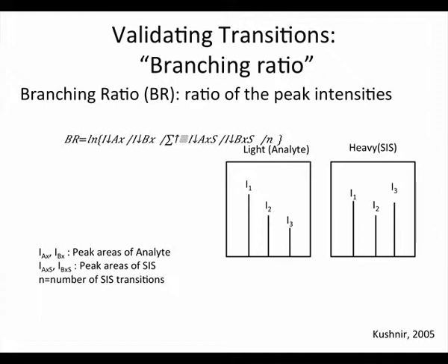What if during your fragmentation, the 2 daughter ions, one is a neutral ion? Then you don't have anything as a reference. So you're saying if one of them retains all the charges and the other one is neutral, then you don't have anything. Then you've done a bad job choosing transitions, right? Yeah, at that point you'll notice that, and I think you'll just have to pick a different transition. I think you'd be able to predict that beforehand, hopefully. I don't think that happens very often, but you would just have to start over.